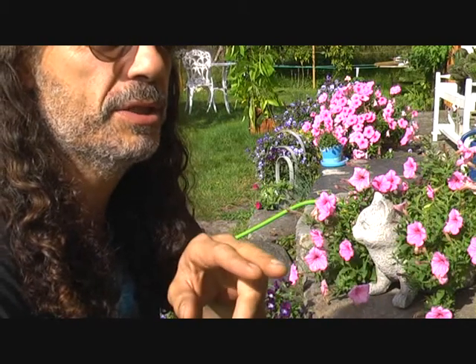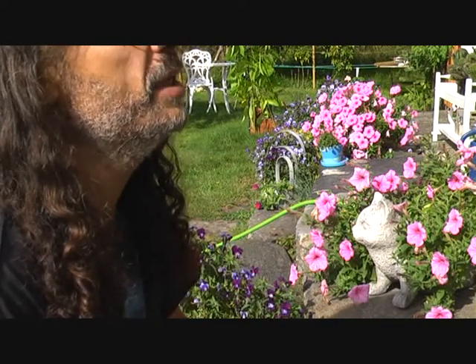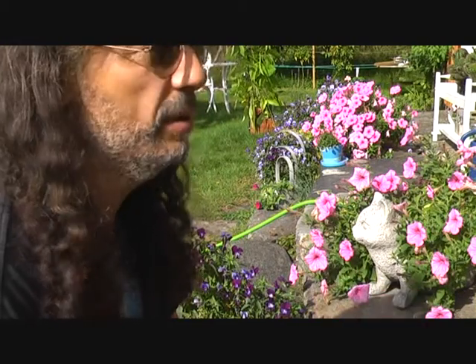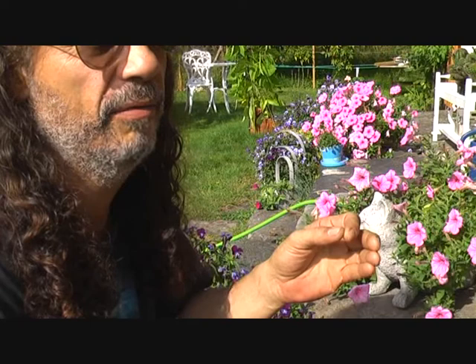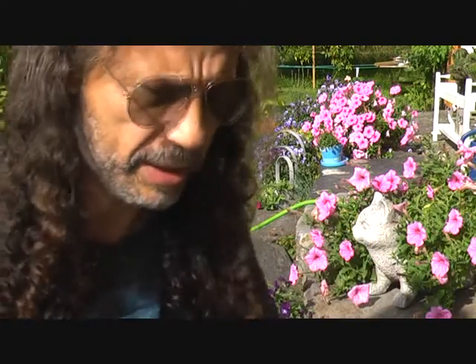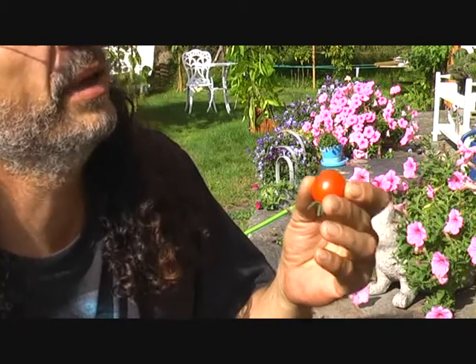But there are differences in sweetness between those two plants. Maybe there's more acid in the one to the right, and that's why we taste the difference. Or maybe people can't taste the difference between a 10 Brix value and 9.2.